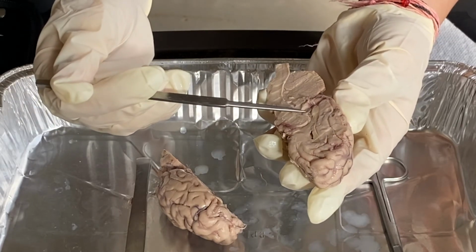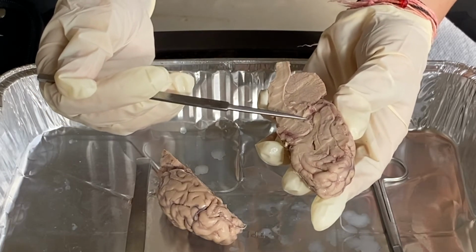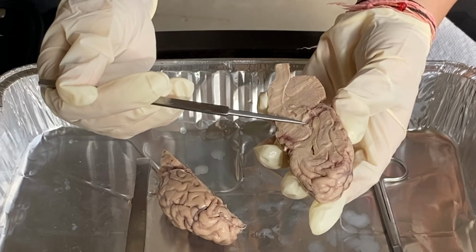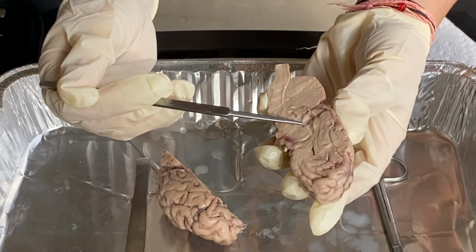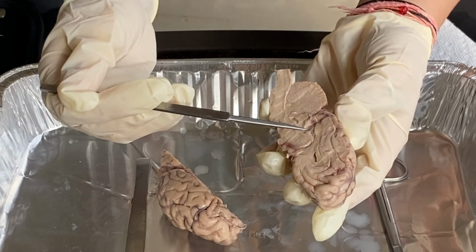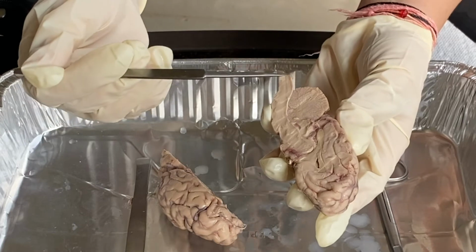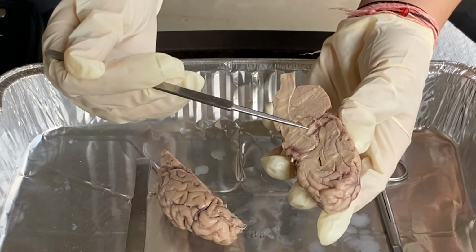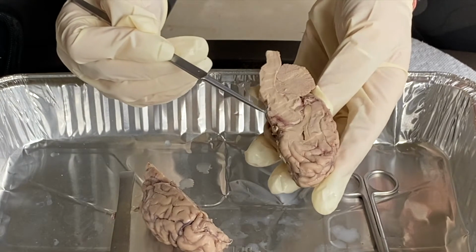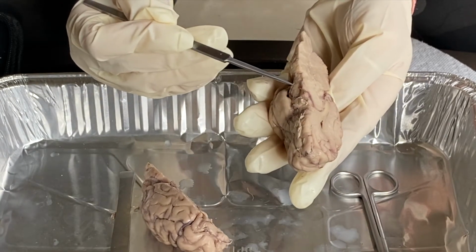Then we have the pineal body, which is responsible for receiving information about the state of light and dark cycles, so basically our circadian rhythms, from the environment. It produces and secretes the hormone melatonin, which regulates our circadian rhythms. Right below the hypothalamus, there's usually the hypophysis, or the pituitary gland.